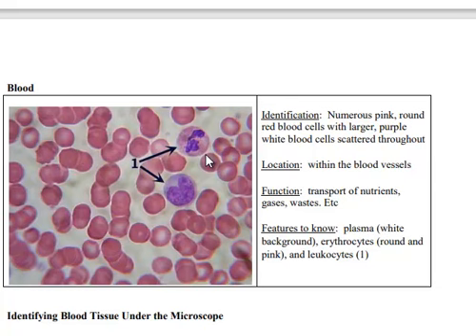So what can you do with your blood? Well, you can protect yourself with the white blood cells, and you can carry oxygen and carbon dioxide using your red blood cells and the plasma. And then there's something called a megakaryocyte, and we don't have any in this picture, but they're huge compared to the white blood cells and the red blood cells. They're really, really large.